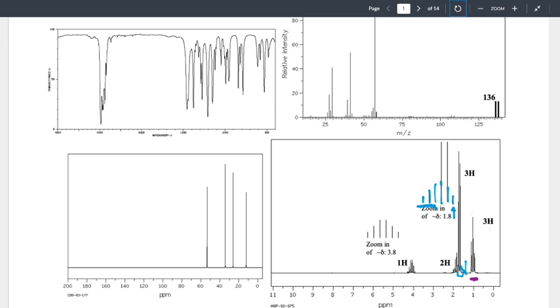So I would be nervous saying it was just 5 peaks. What I would recommend is not saying 5 or 6, because I don't really know. I know at a minimum it must be 5. There's no way it could be 4, because that wouldn't be symmetric.